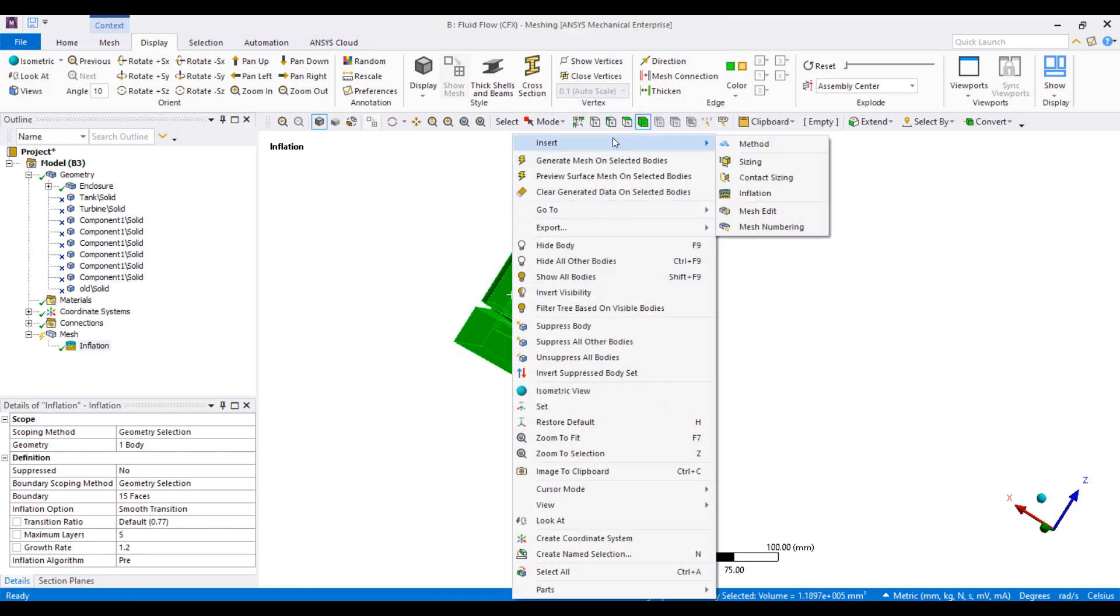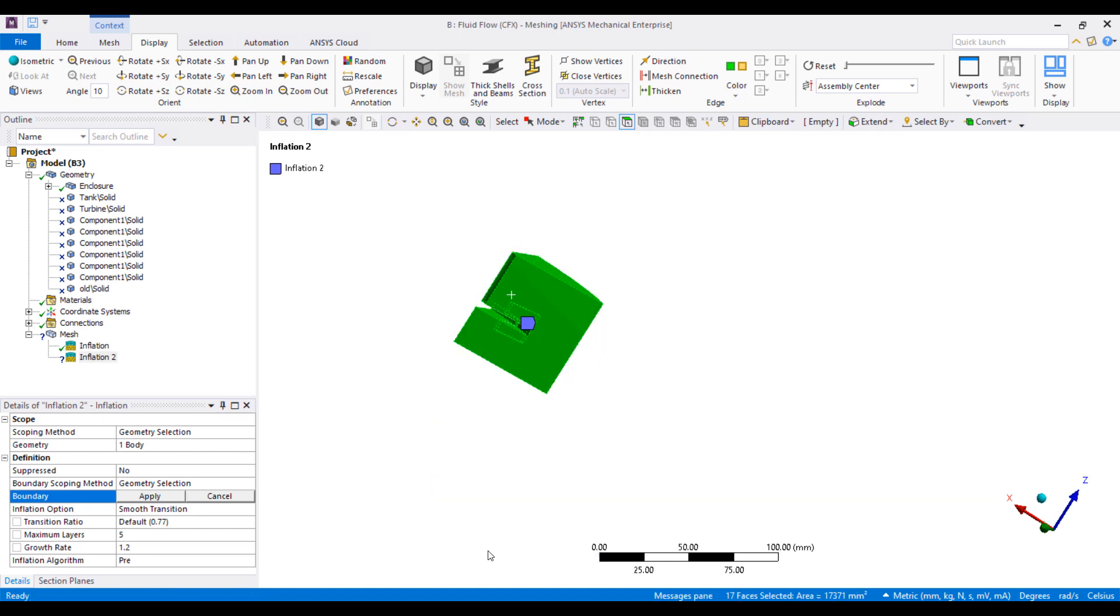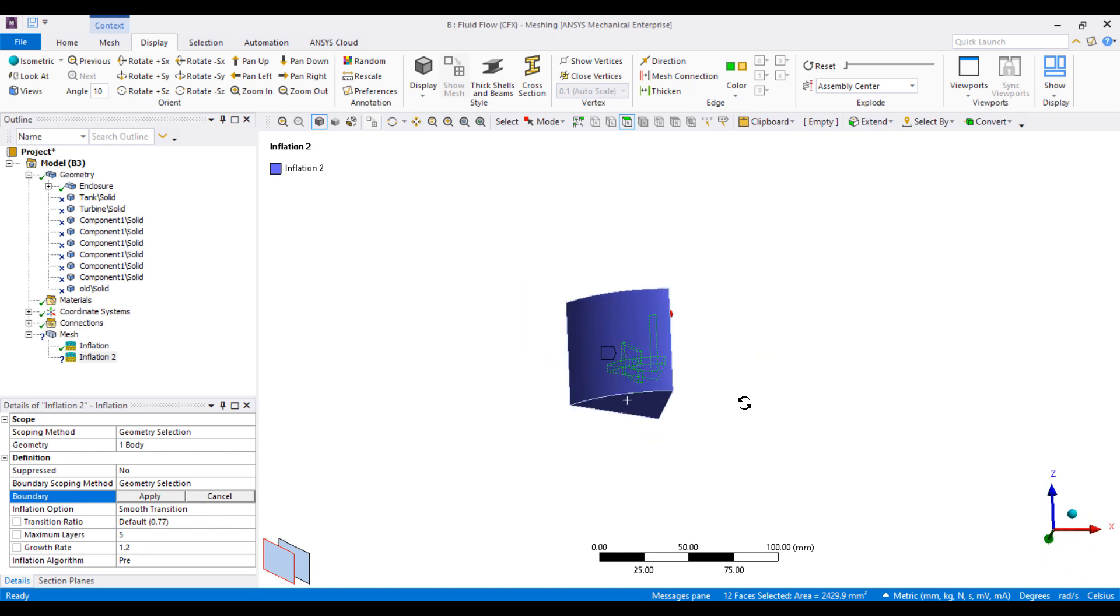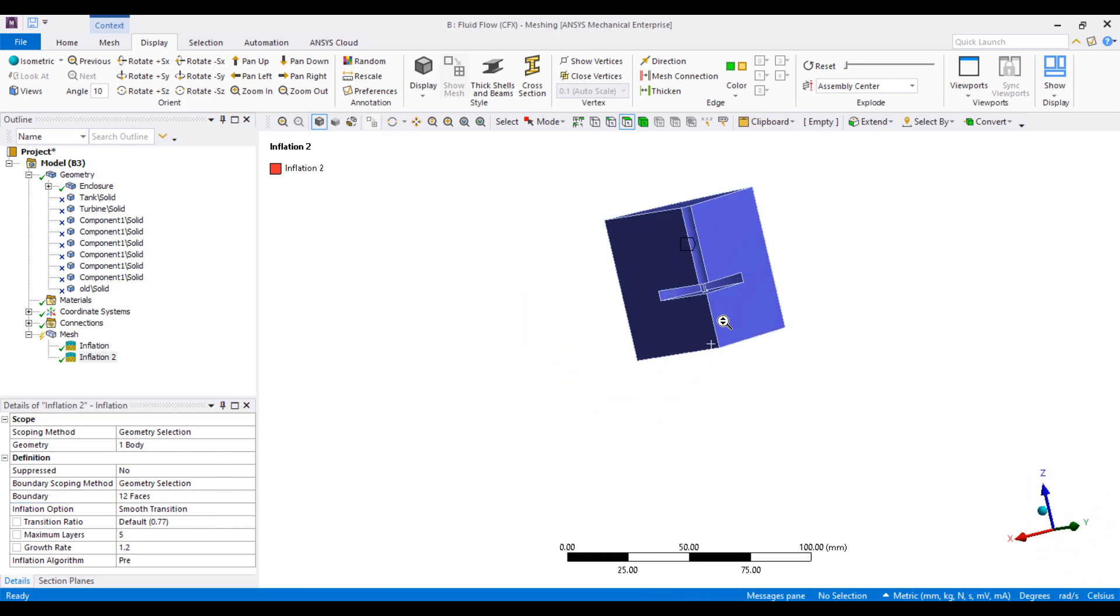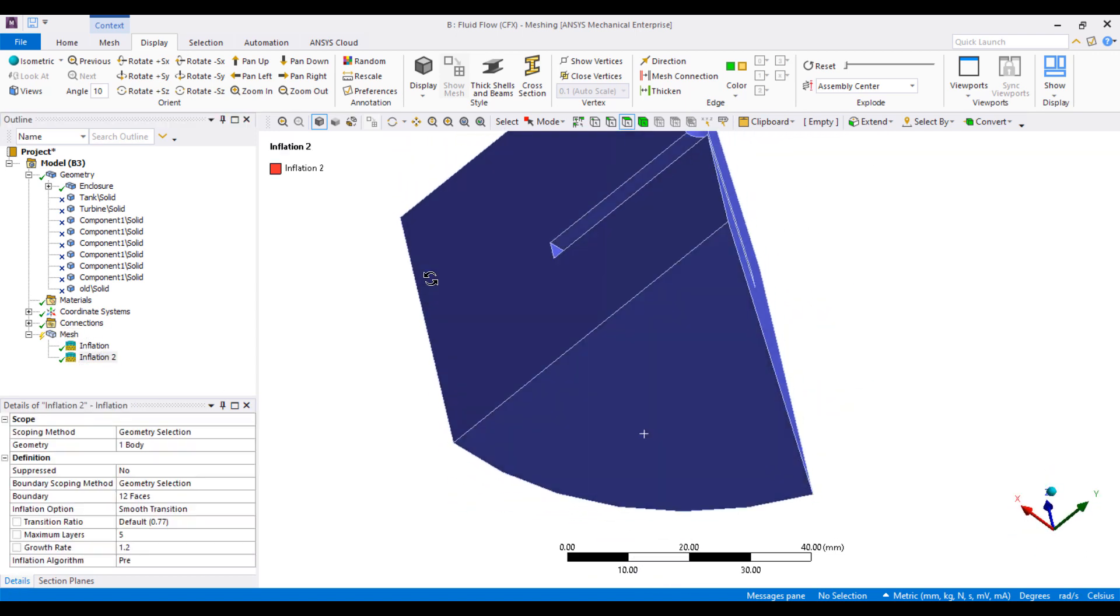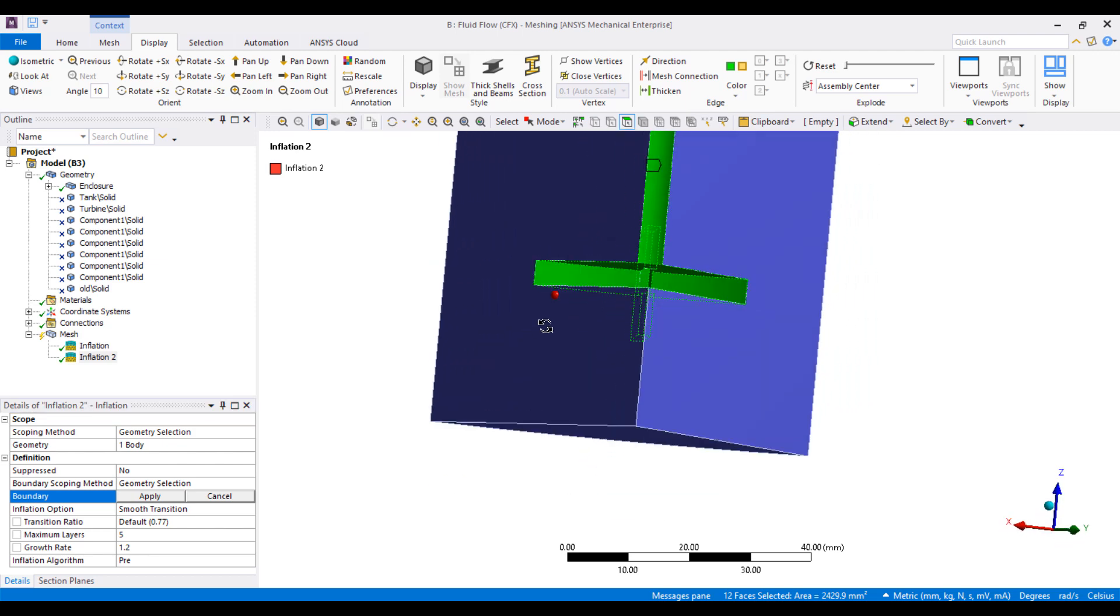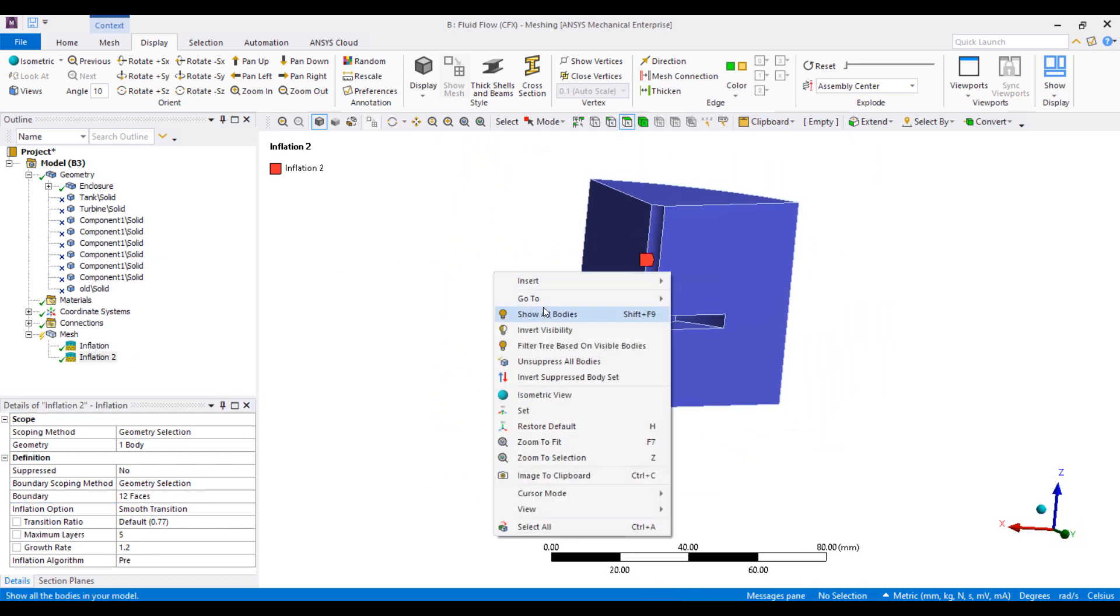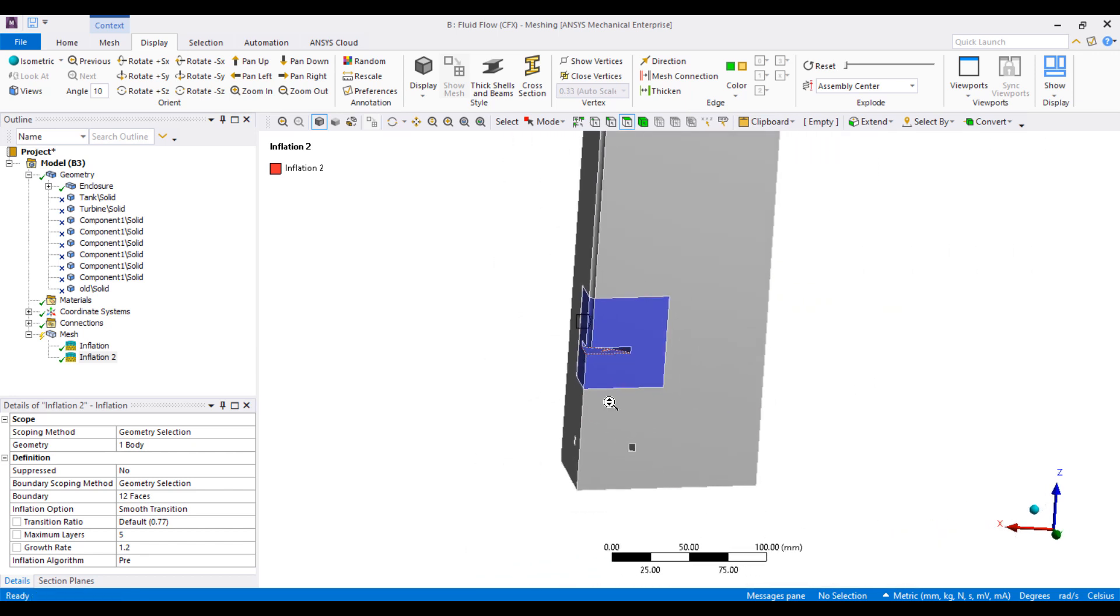Then we will add additional inflation layers on this part. Right-click Insert Inflation, and we'll do the same thing. So I'll start by selecting all of the surfaces and then exclude the surfaces that are not walls. I could also have done a box select to select the interiors.